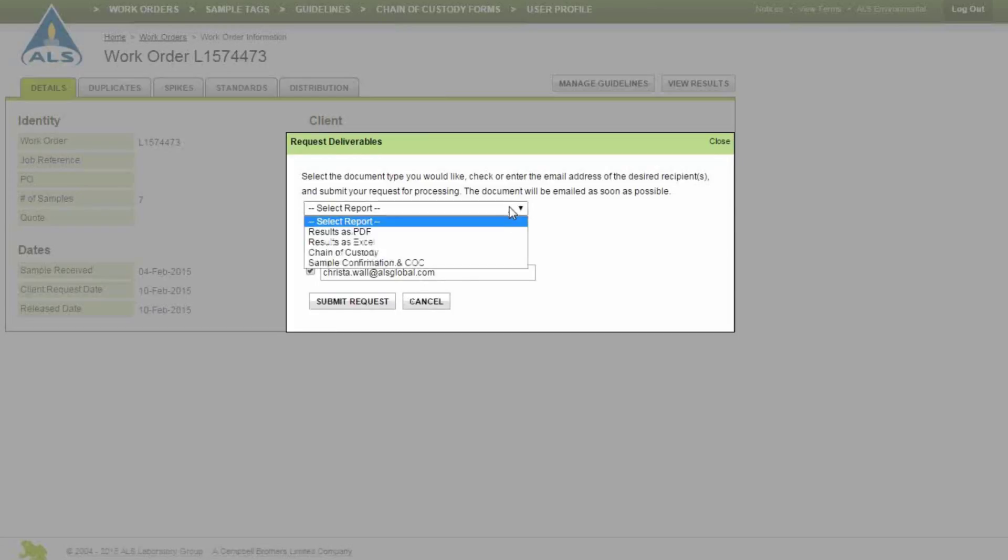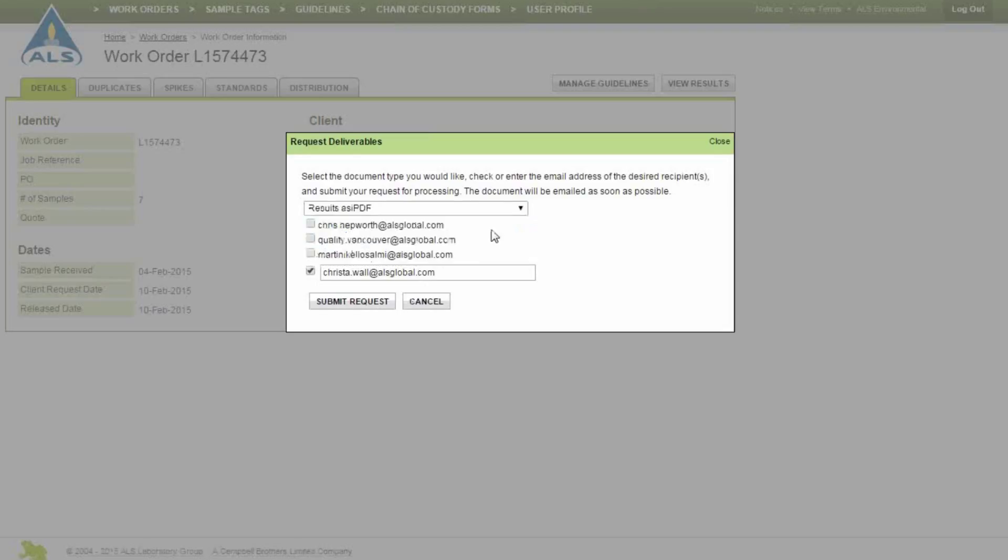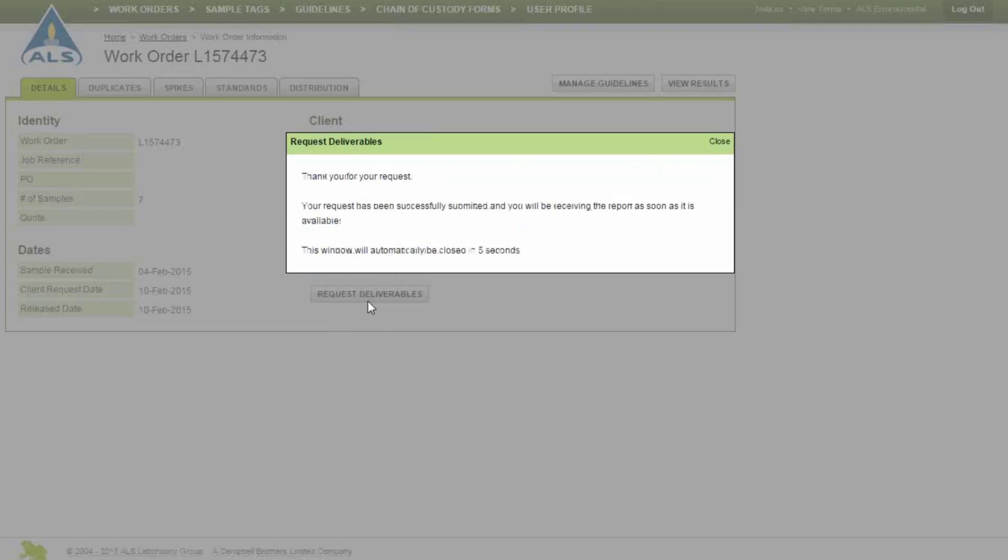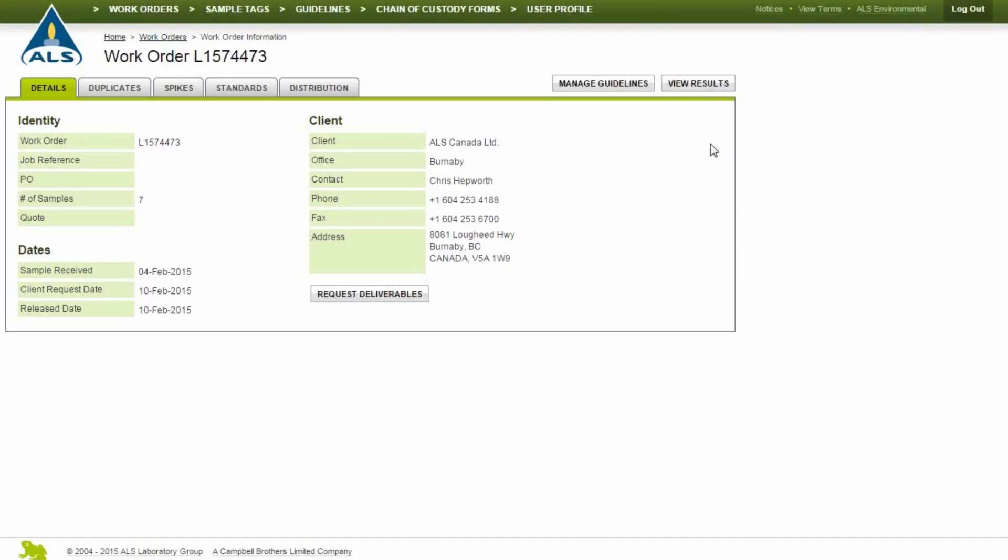Select the report type, add your email address, and click Submit Request. You can also perform this function on the default home screen.